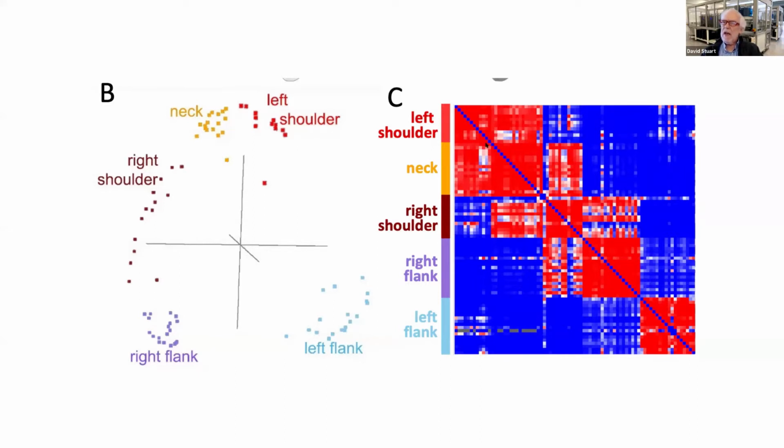And you can see that there are several blocks here of antibodies. There's one block, a little block up at the top. This block here, where there's extremely strong cross competition between this block and this block, as seen by the off-diagonal terms. This block cross-reacts with this block, and then this is almost independent. So this is the output of the clustering algorithm.